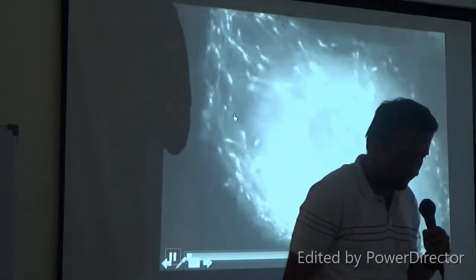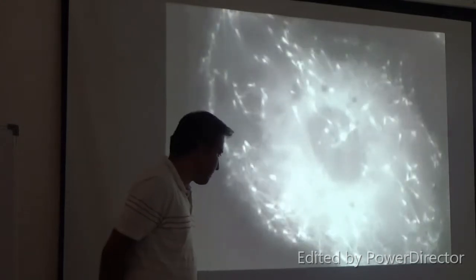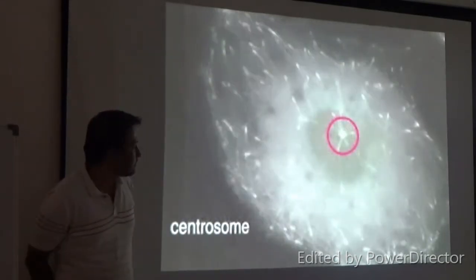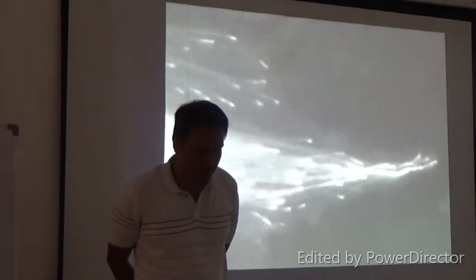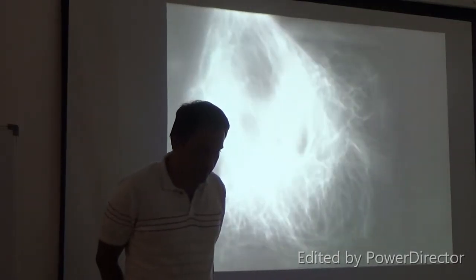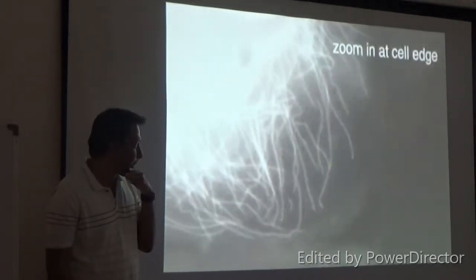We'll first see two instances of why GFP technology can be revolutionary, and then we'll see how it comes about, right? So here, EB1 is a protein that binds to the GTP tubulin cap at the growing ends of microtubules. Cells expressing a GFP-EB1 fusion protein reveal the spectacular dynamics of the microtubules in the cytoskeleton. Note that many, but not all, microtubules in this cell grow from the centrosome. Only the ends of growing microtubules are visible in this experiment. Those that are static or shrinking have lost their GTP tubulin caps and do not bind EB1. In contrast, when all microtubules are labeled with GFP tubulin, the true extent of the microtubule cytoskeleton emerges. Both growing and shrinking microtubules can be observed.